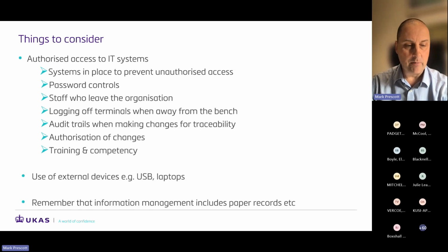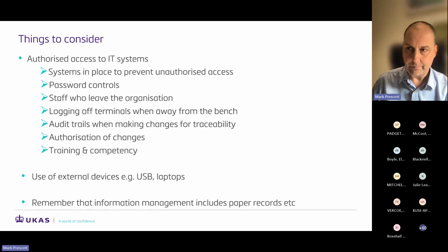For anyone who may have been through an ISO 27001 certification, I've not been through one myself, but I do understand that they even go as far as looking through bins and checking that there's no confidential paper in there. So anything around data management, do remember that includes paper records as well.